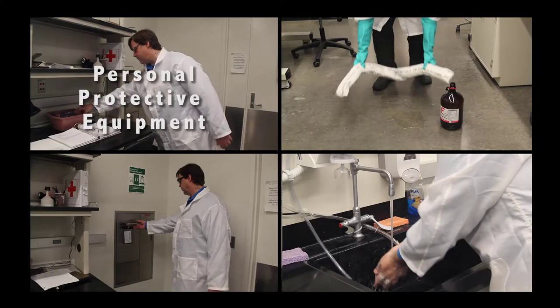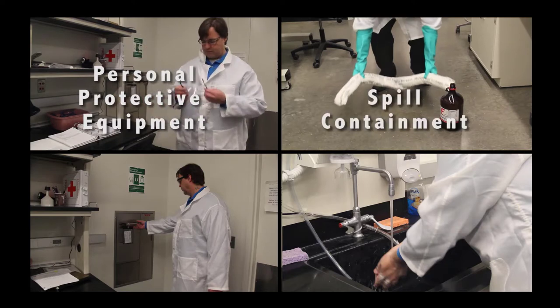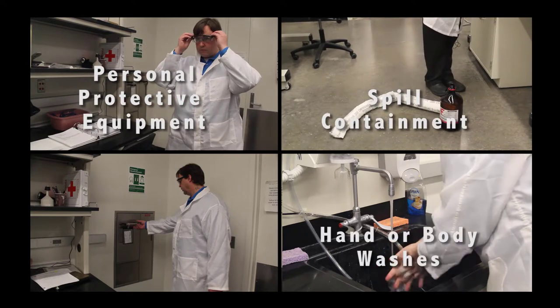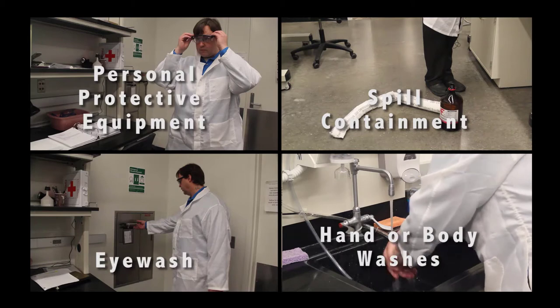This includes personal protective equipment, spill containment equipment, and the sinks, showers, and washes found in the nanofabrication lab.